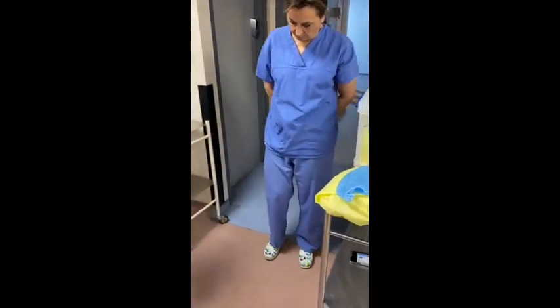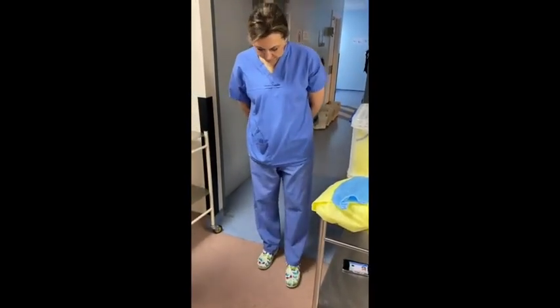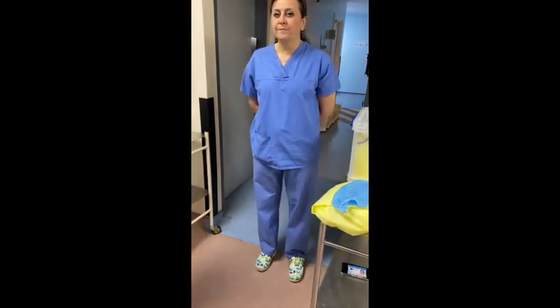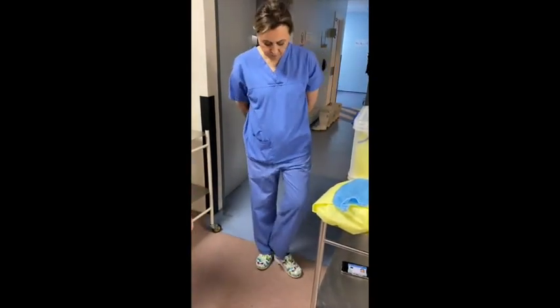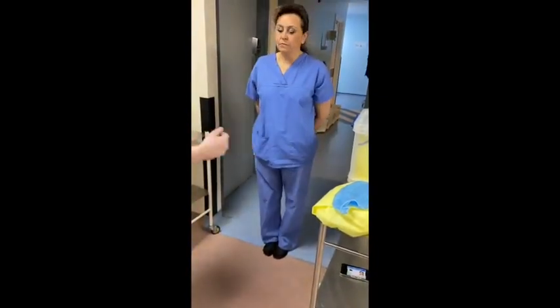Then the next step we need to do before we enter the lab is we'll need to tuck our trousers into our socks. Just pretend Ghada has socks on, and then we'll leave our own personal shoes outside here, outside the door. We'll gather our belongings and we'll enter the lab.